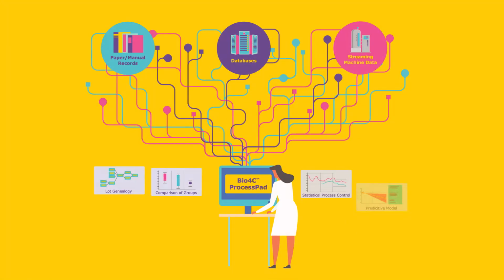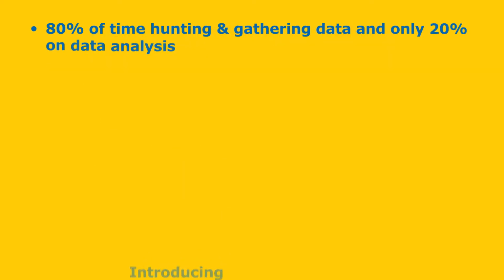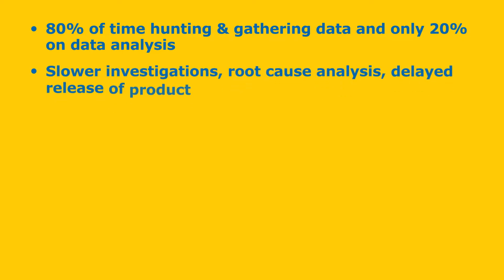A group of bioprocessing scientists and engineers saw the need for a tool that could make data readily available to scientists on the plant floor. They knew it was difficult to get the data. Indeed, scientists were spending up to 80% of their time hunting and gathering data rather than analyzing it. This meant slower investigations, root cause analysis, and delayed shipment of product.